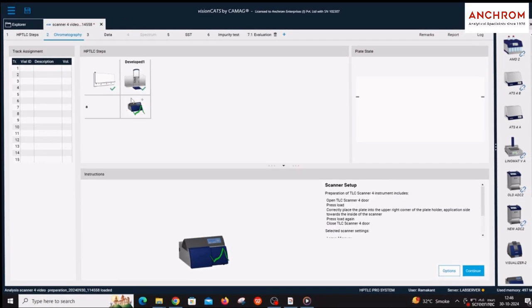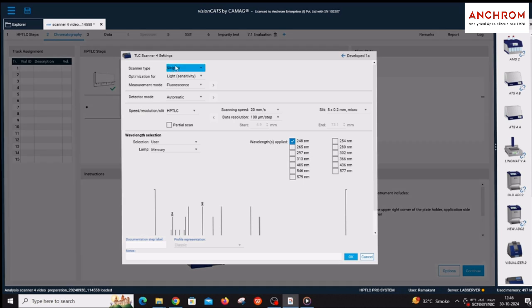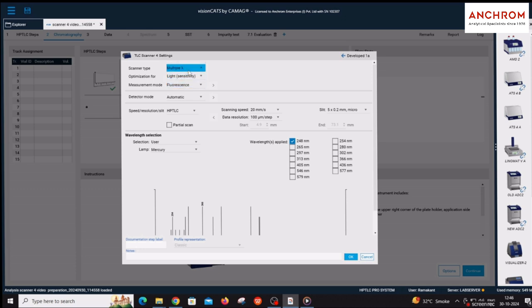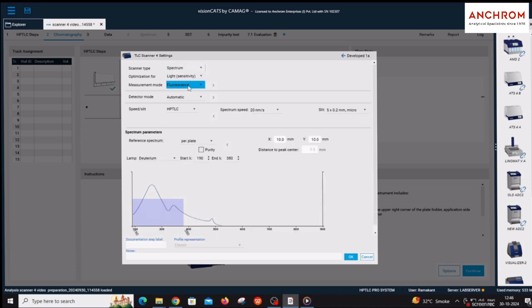In CAMAC TLC Scanner 4, scanning of TLC or HPTLC plates can be done using single wavelength or multi-wavelength options. UV-visible spectrum analysis can be done from a range of 190nm to 900nm.